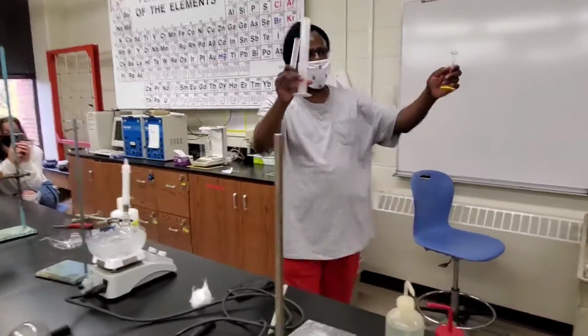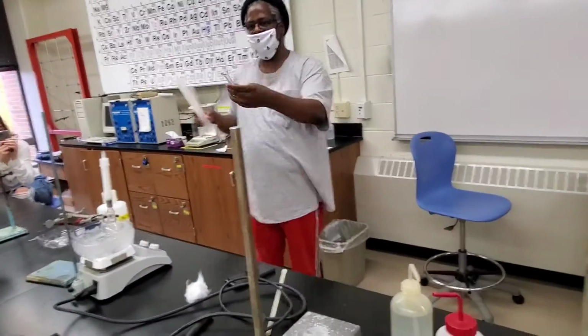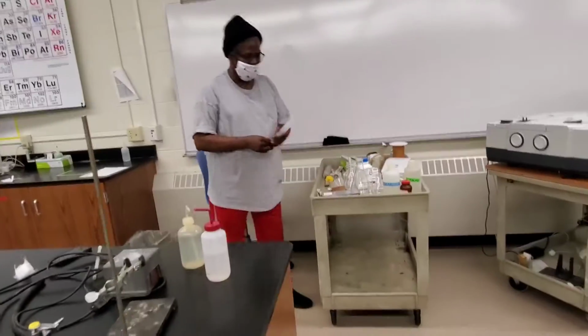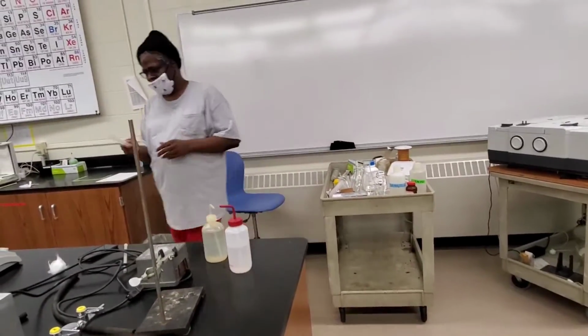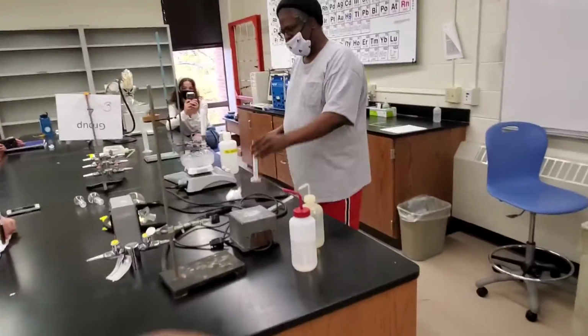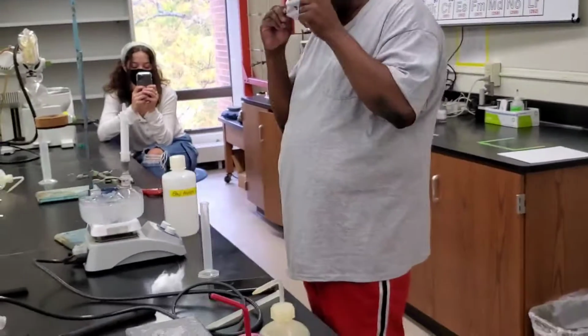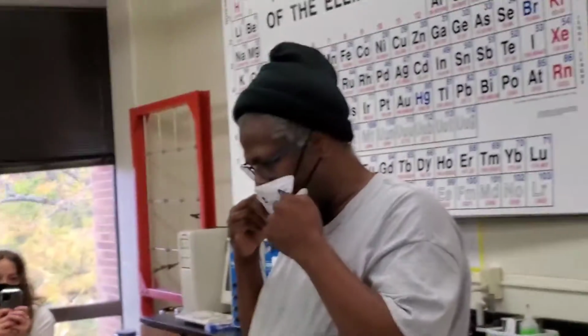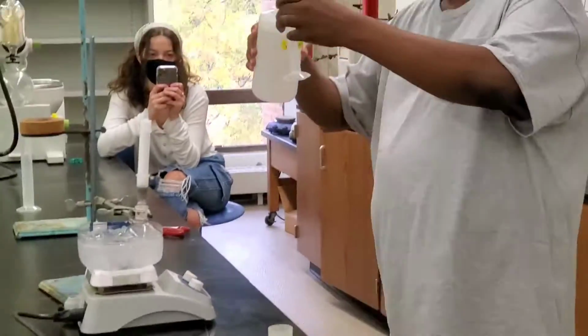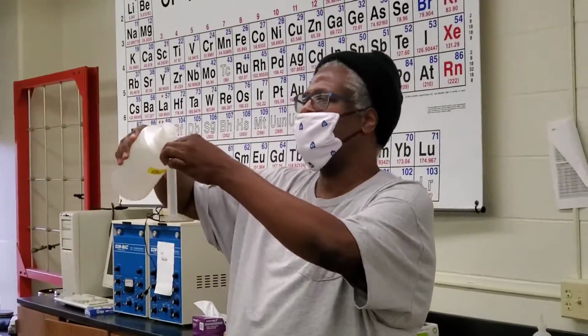We have different types of measuring cylinder, different sizes, glass, plastic. These plastics are made so that they could be resistant to organic solvents. So for the solvent, you don't have to be totally precise. If it says 25 and you got in 24, that's okay. You can put it into your actual procedure section.